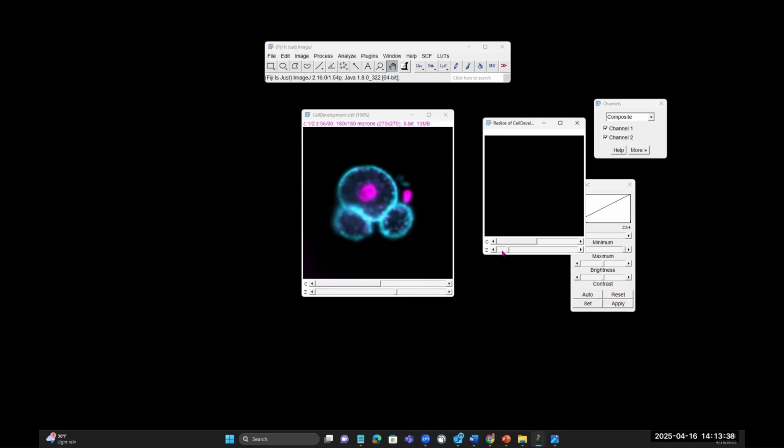Obviously here you don't start until you reach this coordinate, right? Once you reach that, then you would start seeing your images here. So basically this is what you see at the very top, and then as you go down towards your image, you would start seeing the rest of your image stack. And that would be reslicing.